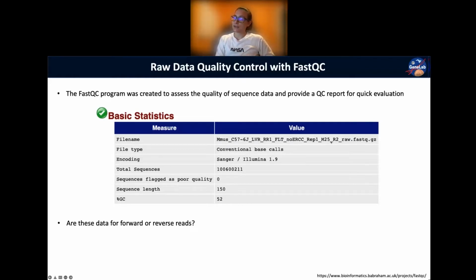So I don't want you guys to get too used to this because most bioinformaticians, when they're preparing their file names coming off the sequencer or coming off the BCL to FASTQ algorithm from Illumina, will have a 1 or 2, some indication of the read number in the file name. However, people can change file names. And so most bioinformaticians will make sure in the file name, if it's paired end read, that it'll indicate either R1 and R2 or just a 1 and a 2 or something like that. However, that's not always the case. So although we do see that here, you can't go by that exclusively to know if this is forward or reverse, but in this case, it's true.